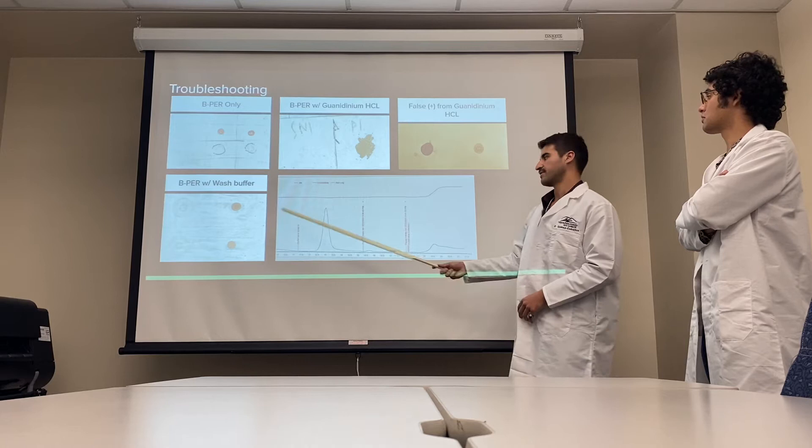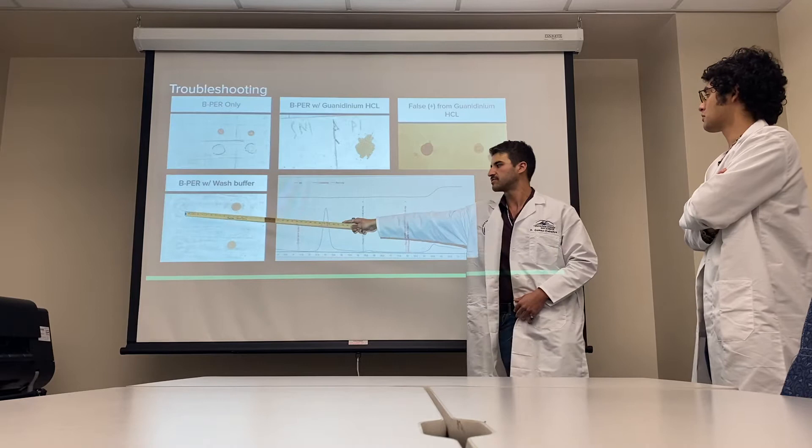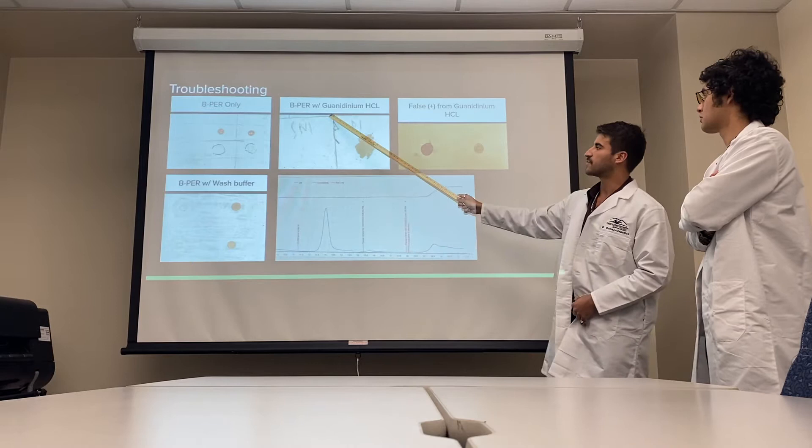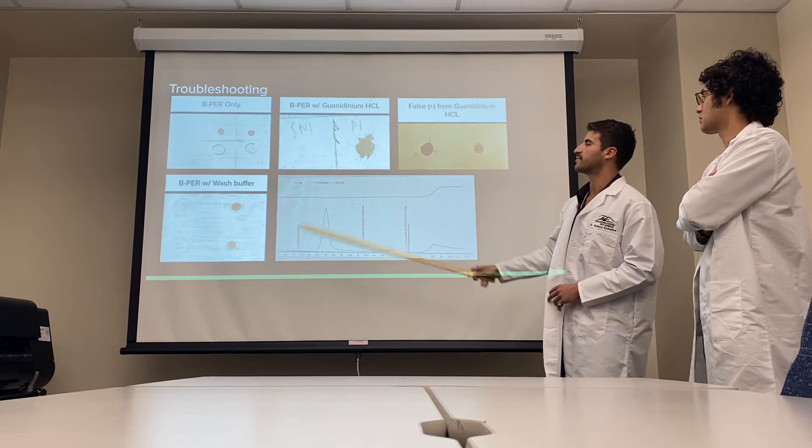We then tried different things, like putting it in the wash buffer — a phosphate buffer — to see if it would yield any different results. But the supernatant was still very clear and the cell pellet still very dark. We tried guanidinium, thinking that a denaturing agent would be enough to do the job, but we had the same problem: nothing in the supernatant and all in the cell pellet.